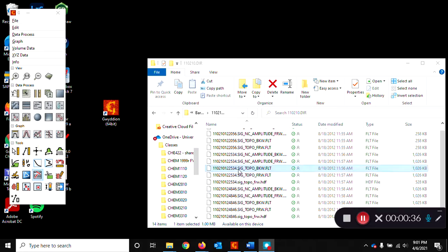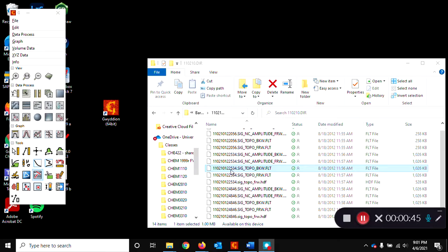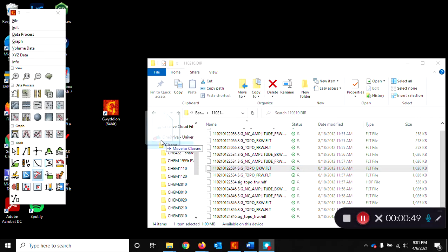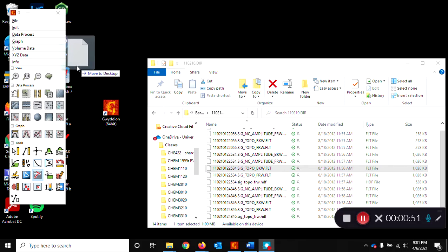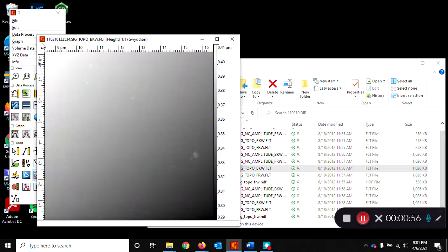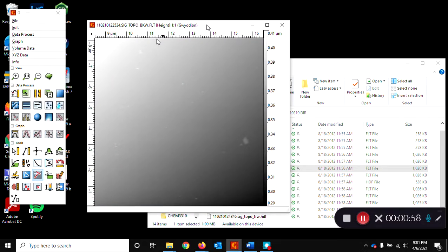Next you want to find your data file and Gwydion can read almost any type of AFM data format as far as I can tell. So for example let's click and drag this topographical AFM file into the files part of the control window and it will automatically pop open a data window with your image in it.